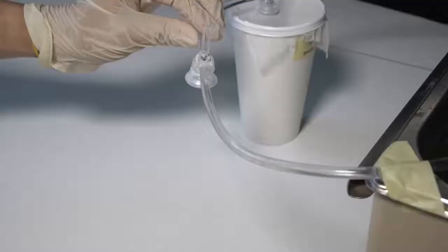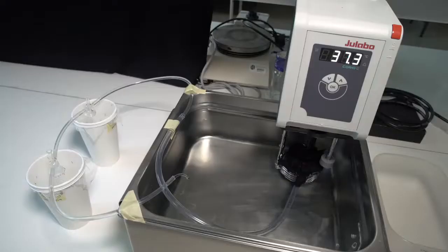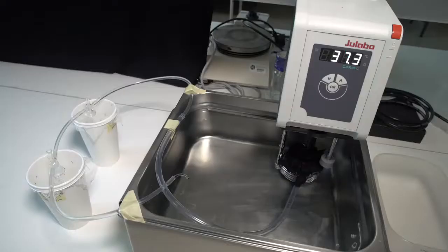The use of a blood-free diet is highly advantageous over blood. A blood-free diet does not have the ethical constraints associated with the use of human blood or experimental animals. Replacing animals in experimentation is part of our 3R policy: replace, reduce, refine.